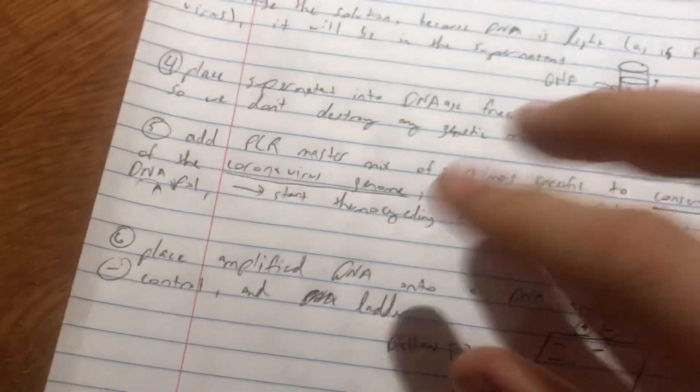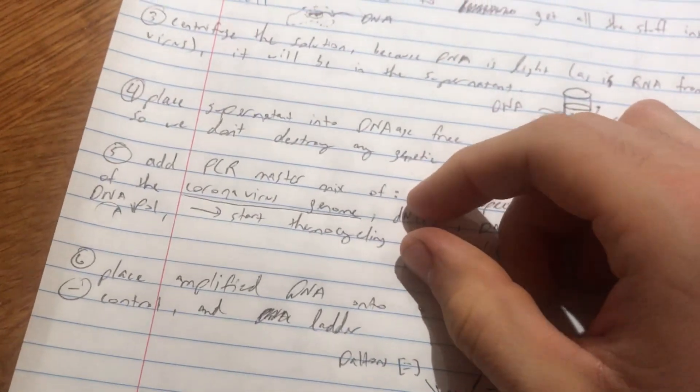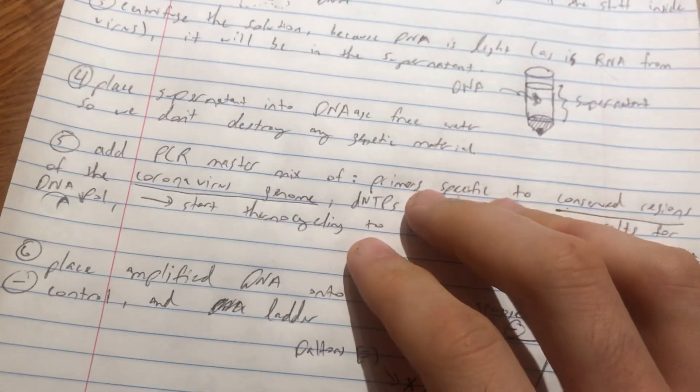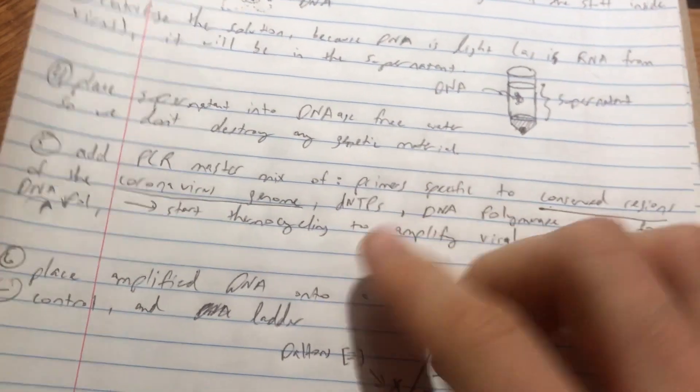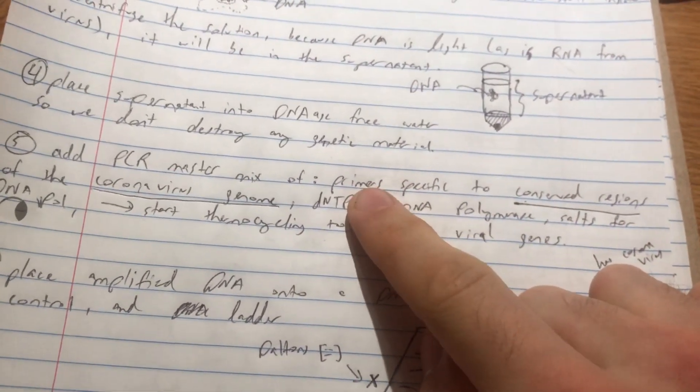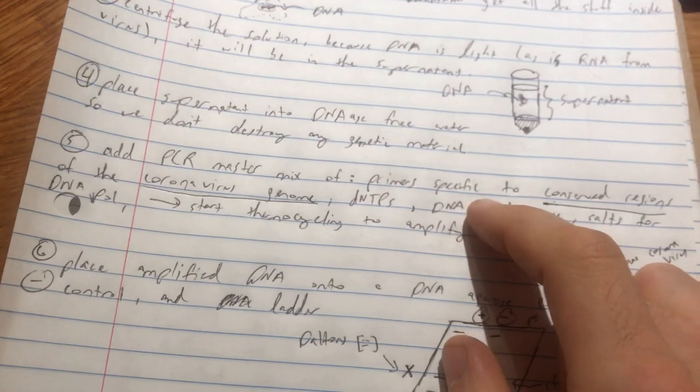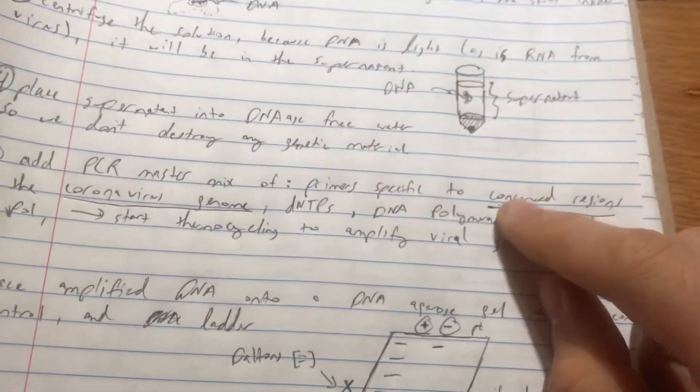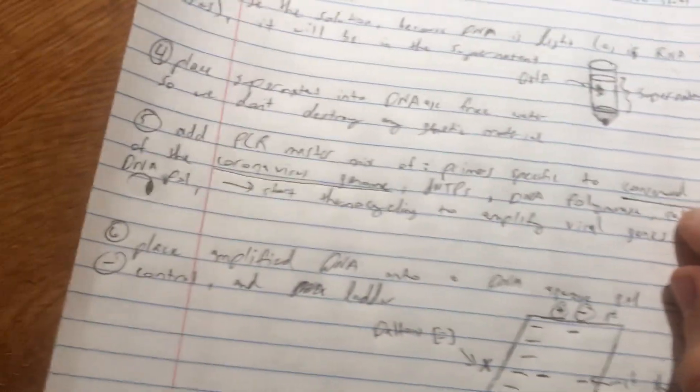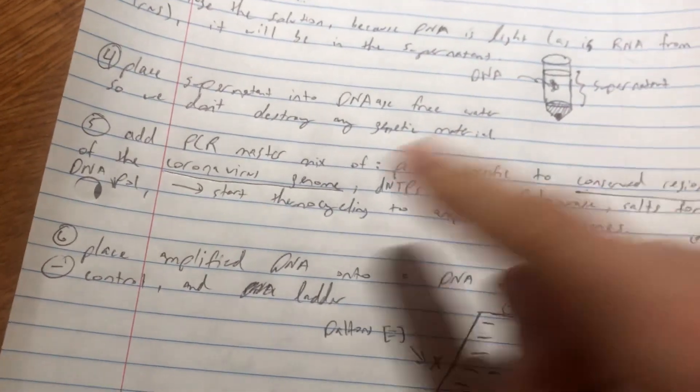And then we're going to start thermocycling. So this is just PCR. Don't worry about understanding all of the details if you're not quite familiar with it, but basically the point is that we have primers in the master mix, which comes in that test kit that comes from the government right now, that helps us identify those conserved regions of the coronavirus genome.